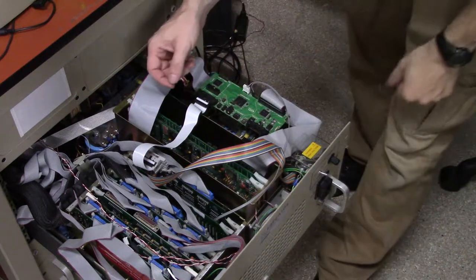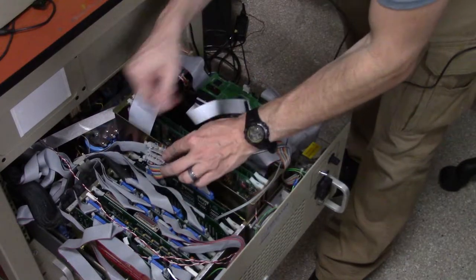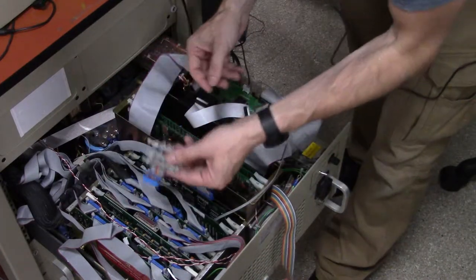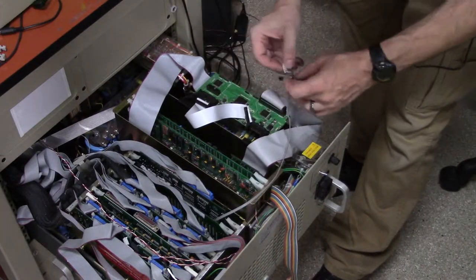If you want to disconnect the daughter board and take it out, you need to first disconnect a few cables. Disconnect the cable going to the dark cage and take out this piece, then also disconnect the daughter board from the main board.